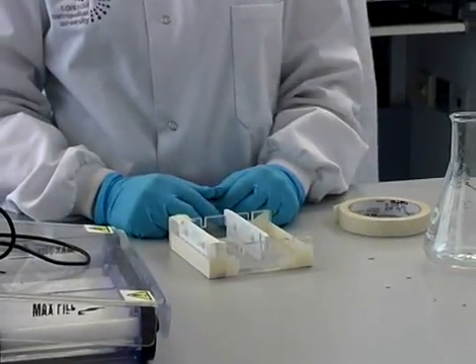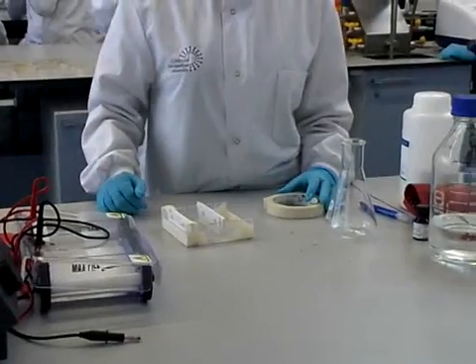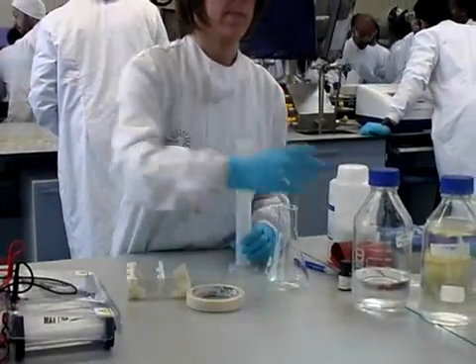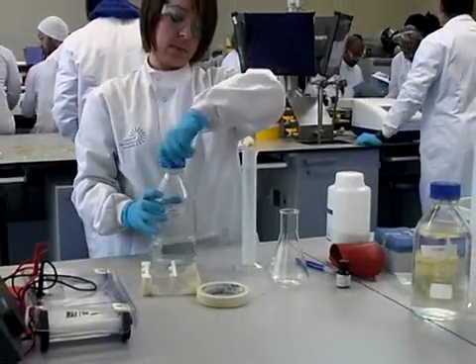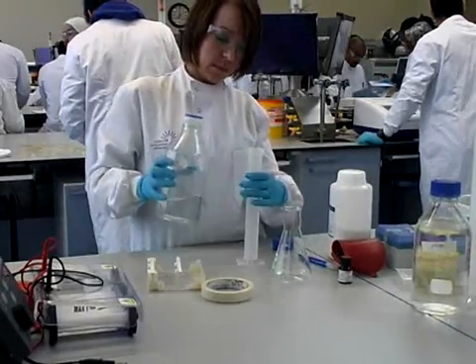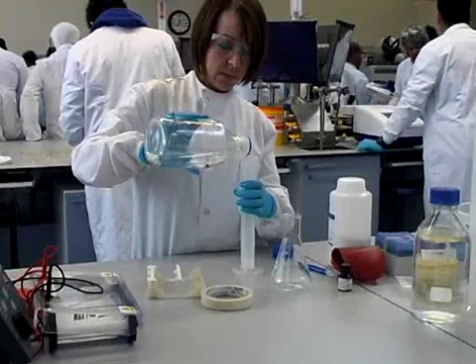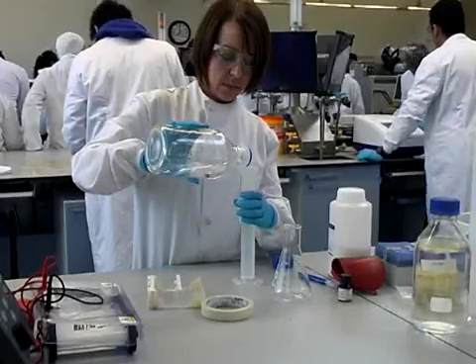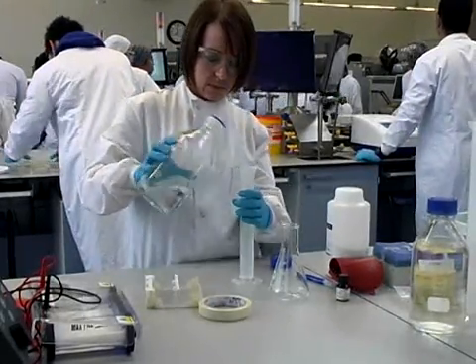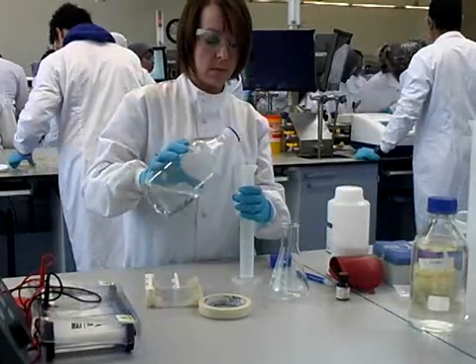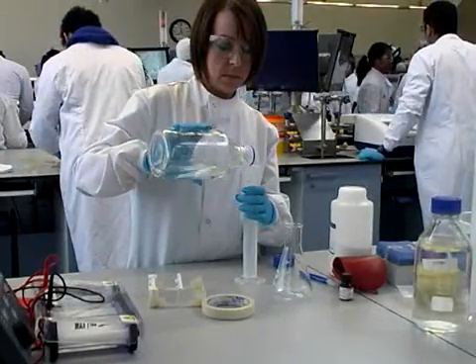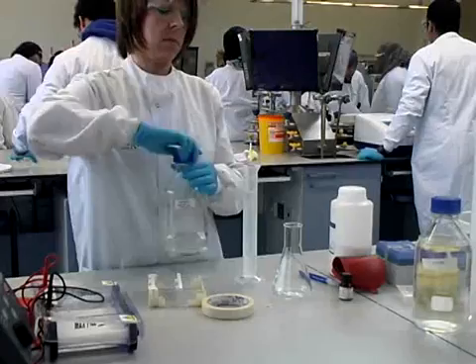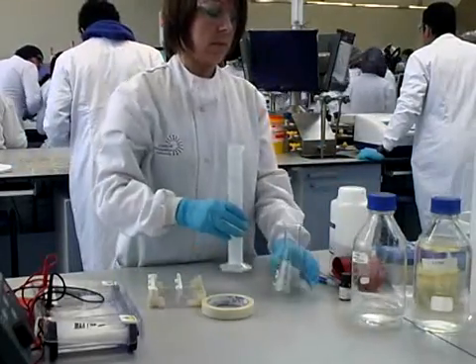We will now prepare the agarose gel. For preparation we require 100ml of Tris-Borate EDTA which is measured out using a measuring cylinder. We have 100ml of Tris-Borate EDTA and are going to prepare a 1% solution of gel, so we need to add 1g of gel to the Tris-Borate EDTA.